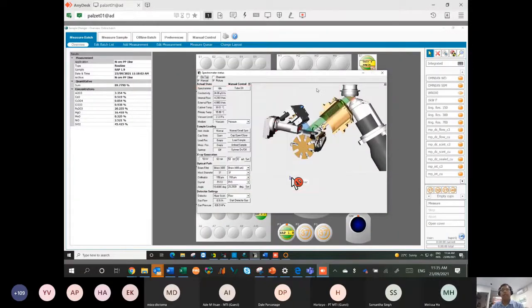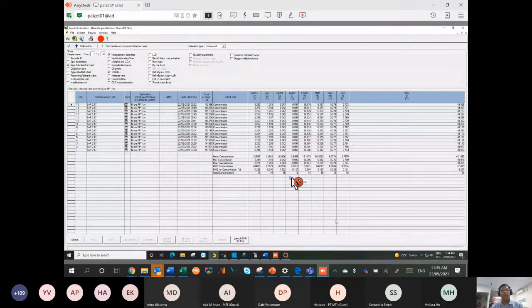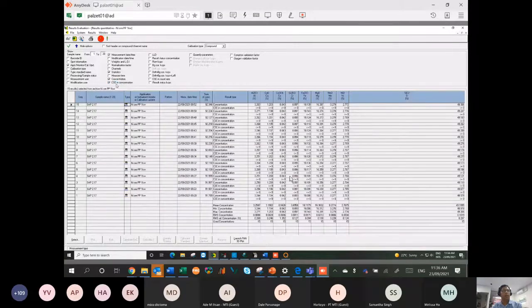I can give you a quick practical example. Just see my screen. Assume that this sample is your QC sample. So run it, say 10 times. Here you already see that the sample has been run 15 times. And in the SuperQ software, there's a nice feature where you can turn on what's called statistics and also the counting statistical error.